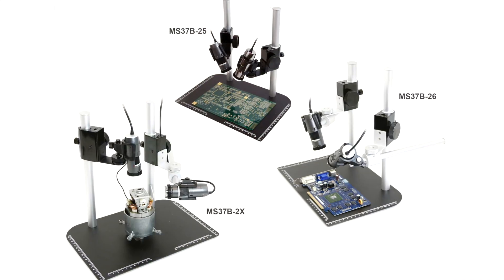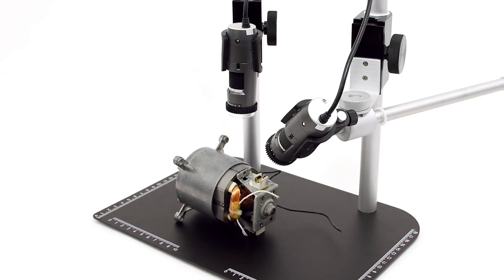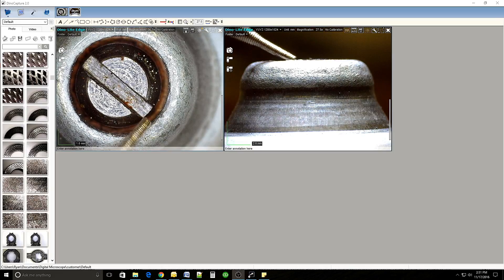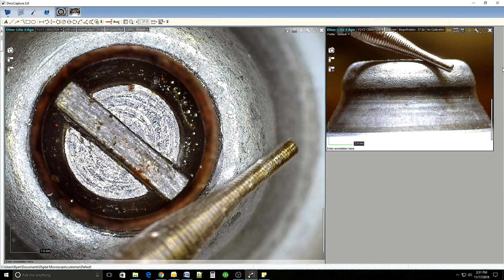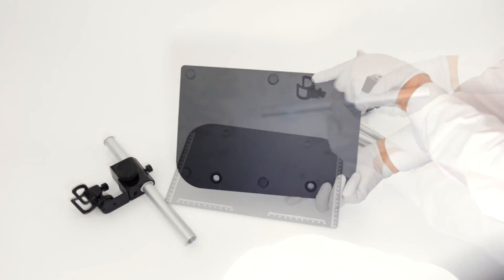Introducing the MS37B, a dual-scope inspection stand that uses a single sturdy base. The black solid base has line gauges to aid in positioning and size references.